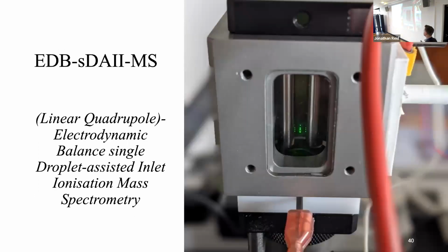And just to talk about the single droplet work that is currently being developed right now, it's quite similar to what Jamie uses. It's a linear quadrupole electrodynamic balance, single droplet assisted inlet ionization mass spectrometer. This is a picture that Jim took, which I'd like to say right now, thank you, Jim, for all your help. Here we can see some levitated water droplets in a very similar sort of chamber to what people in Bark use as well. We're planning to make this a double chamber, so we have a sort of holding cell and then we drop one down to analyze as it gets sucked into the mass spectrometer.